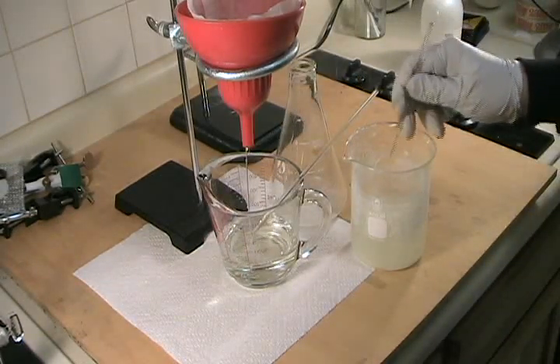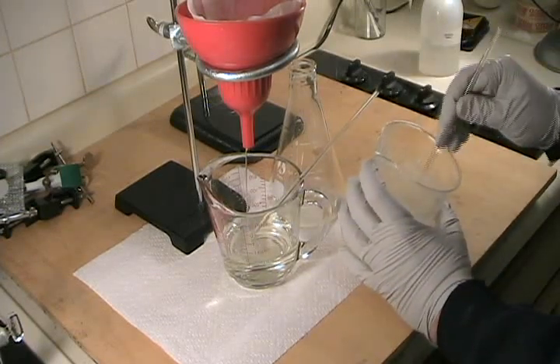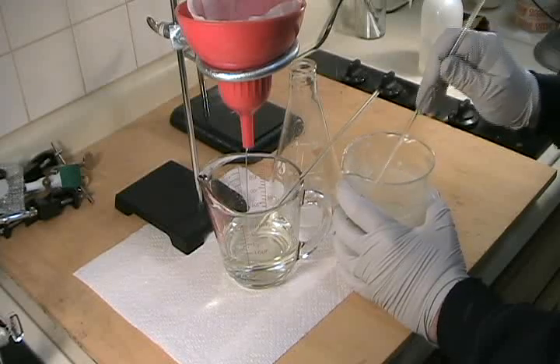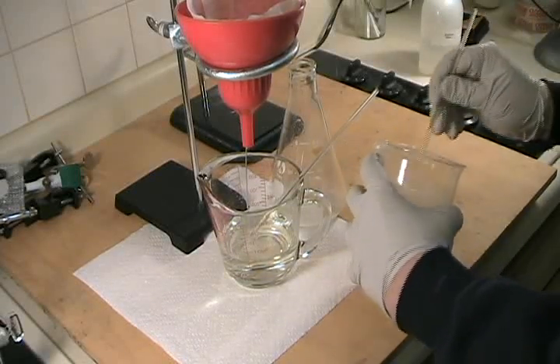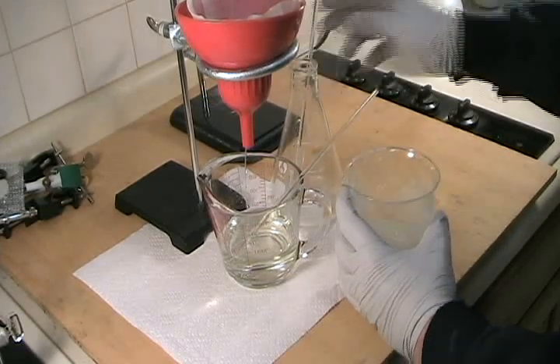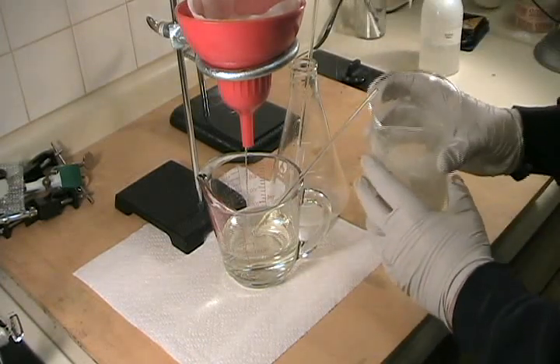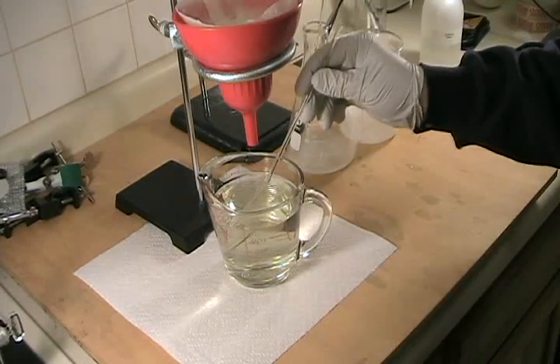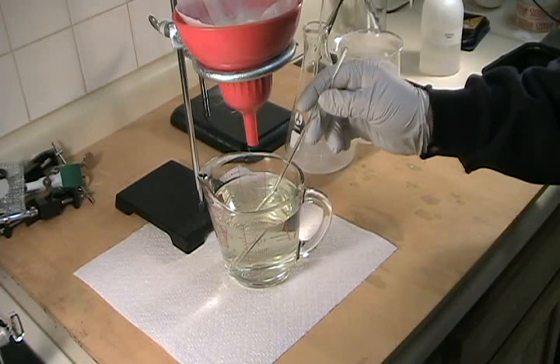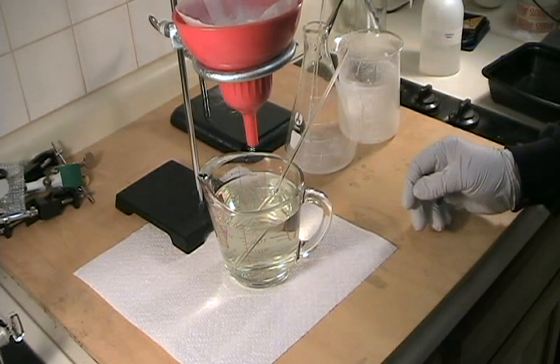As you can see, the filtrate is now colorless and clear — it looks like water. So we've captured nearly all of the crystals in the filter paper. The filtrate has a very slight yellowish tinge due to dissolved ammonium metavanidate, which is very slightly soluble at this temperature, but the vast majority of the ammonium metavanidate has crystallized out and we've captured it in the filter paper.